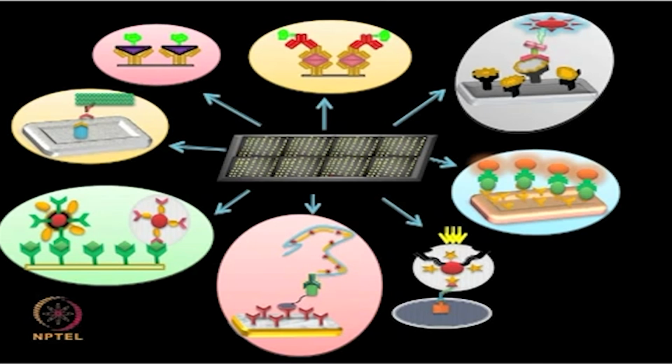These various novel detection techniques which we have discussed today have facilitated sensitive, specific, high throughput as well as rapid analysis for many proteomics based applications.